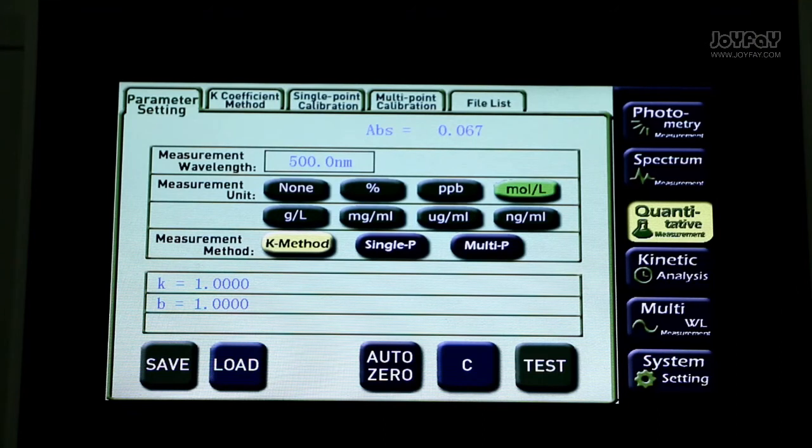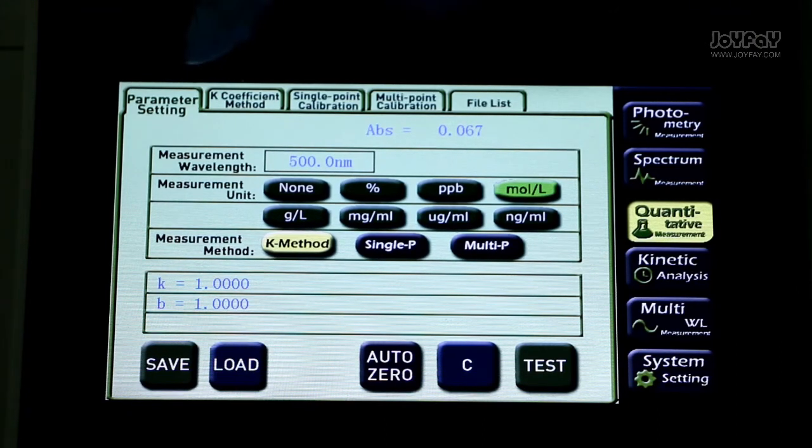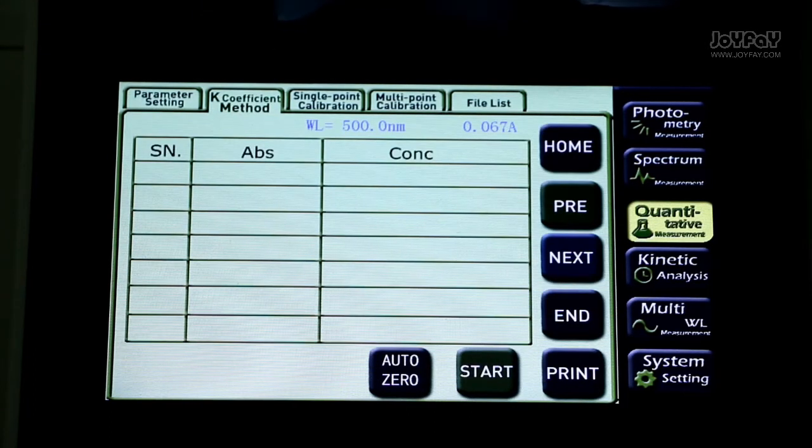The third method, quantitative measurement. Here we have five tags: parameter setting, k coefficient method, single point calibration, multipoint calibration, and file list.